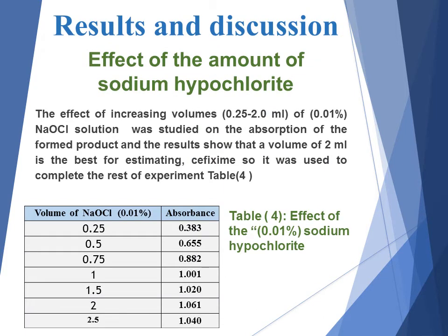Effect of the amount of sodium hypochlorite. The effect of increasing volume from 0.25 to 2 ml of 0.01% sodium hypochlorite solution was studied on the absorption of the formed product, and the result shows that a volume of 2 ml is the best for estimating cefixime, so it was used to complete the rest of the experiment as shown in table 4. Table 4, effect of the 0.01% sodium hypochlorite.